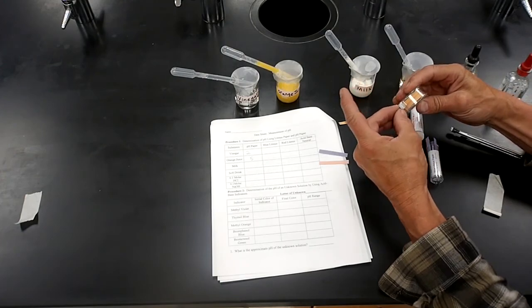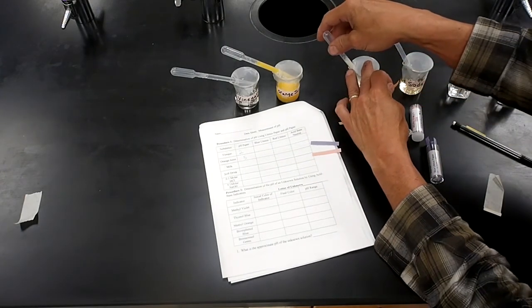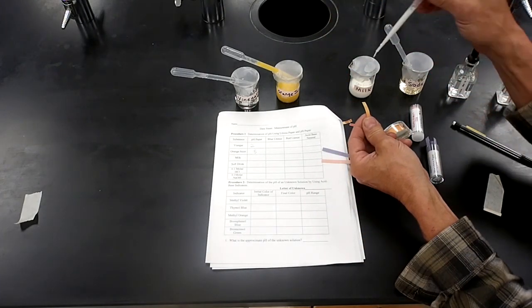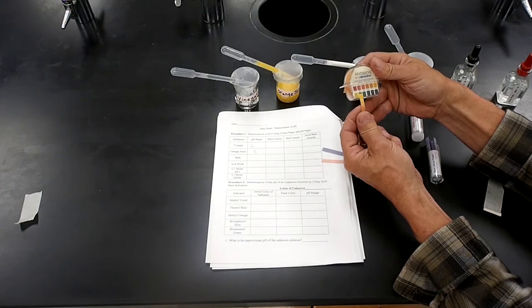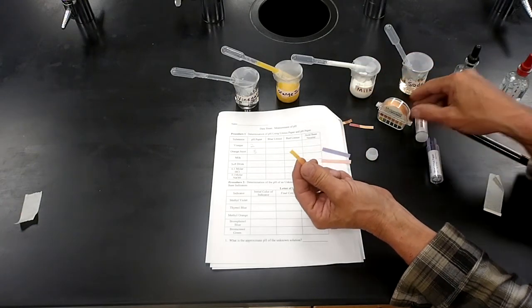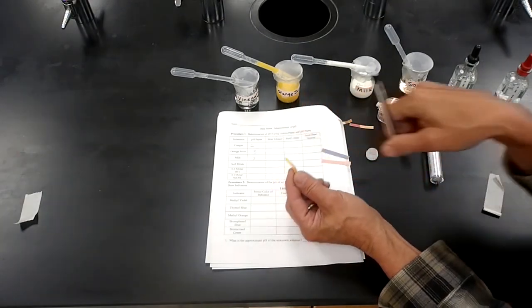Then I'll pull another sample out. Another bit of paper, get some milk. Milk kind of turned everything white, but wow. I'm going to call it 7. pH of about 7 for the milk.